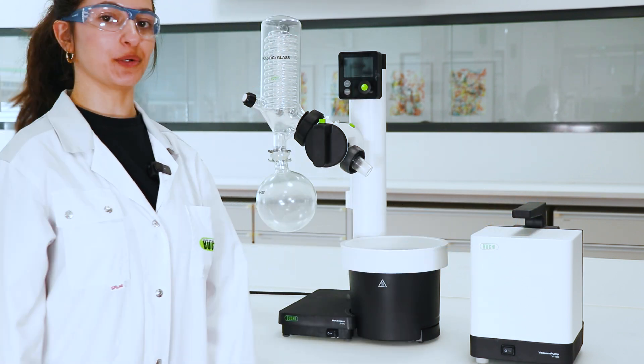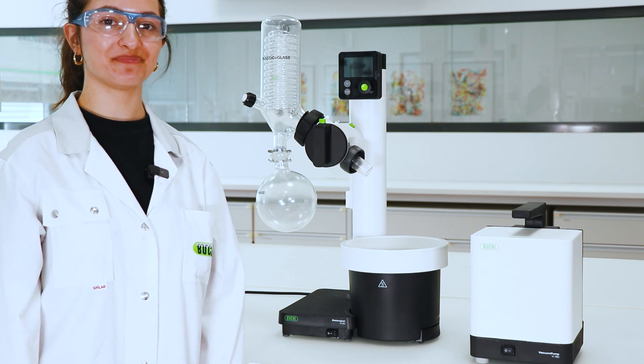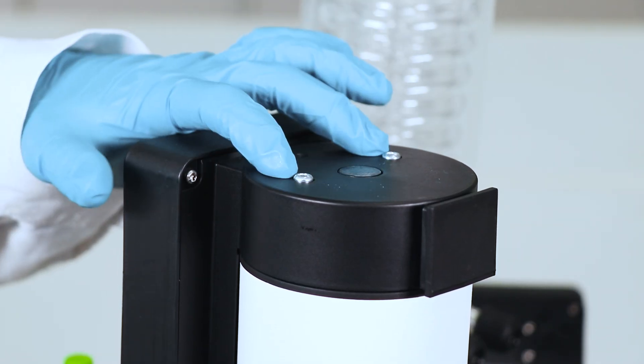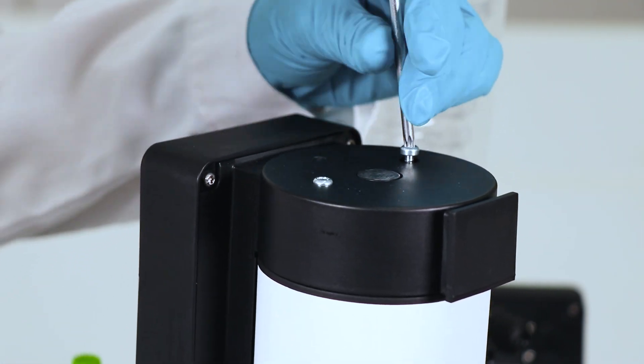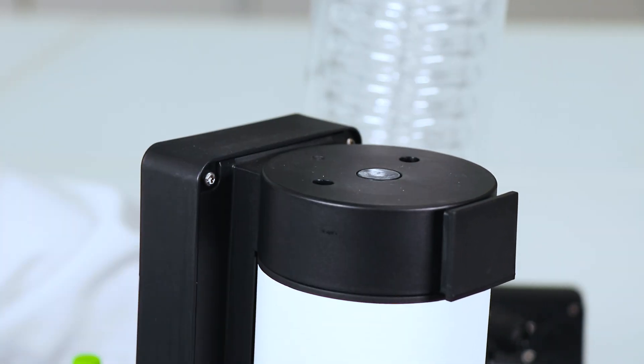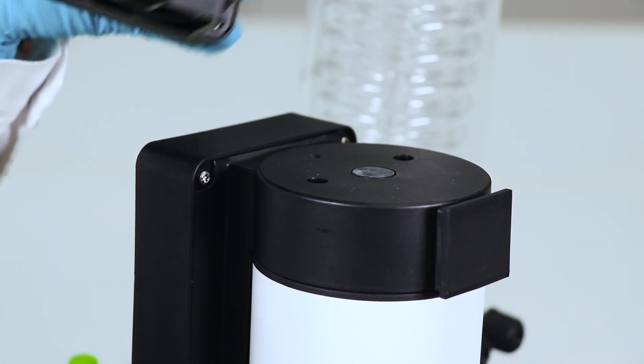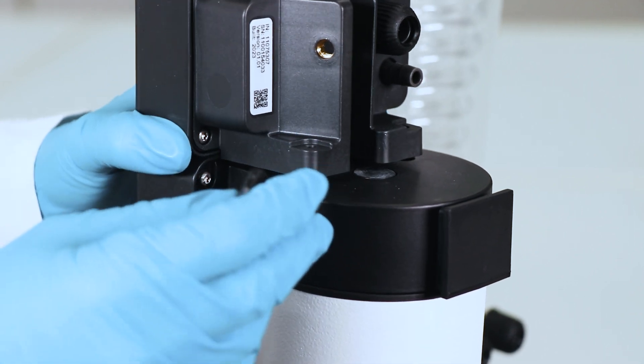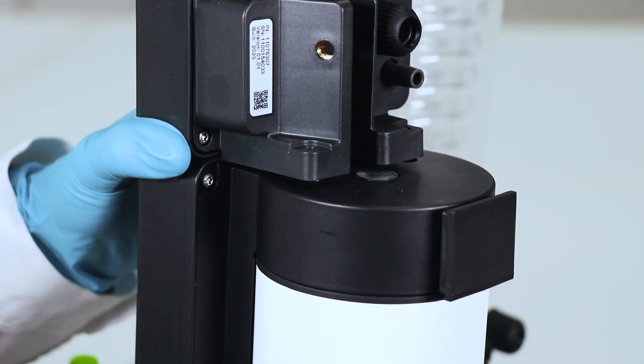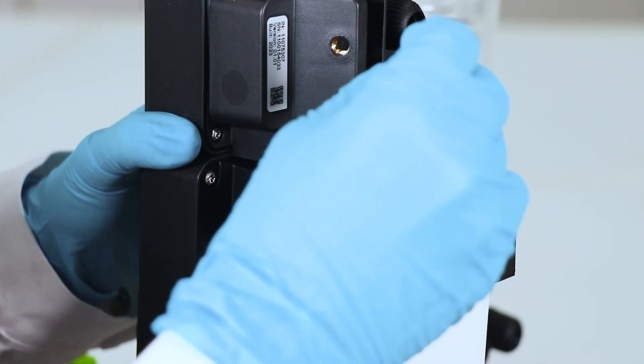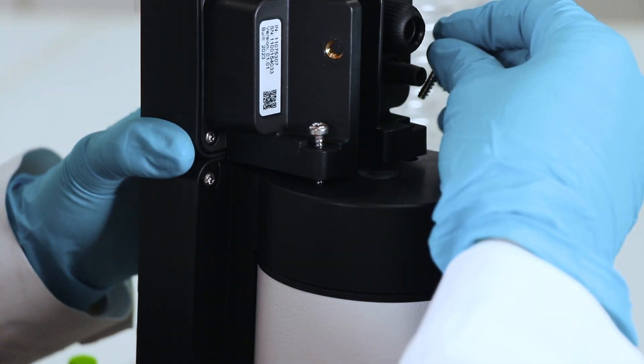We're going to connect that to the power and I will show you later how we connect the vacuum to the R80. So the first thing we do is we take out these two screws. Then we place the interface I-180 on top of this one. And we take the longer screws to place them back in here.